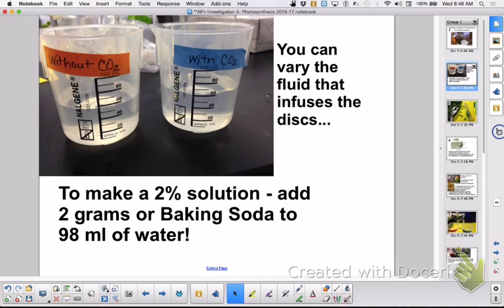What did the lab book say? You tell me. What were you supposed to do? Just what are the two solutions? Water and soap, and bicarbonate. Yes, water and soap, and baking soda or bicarbonate.